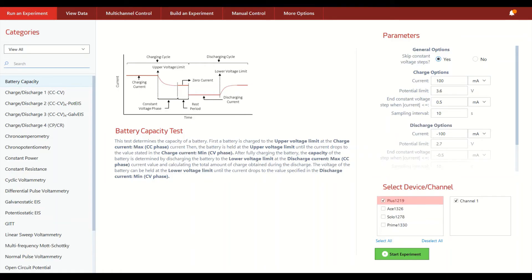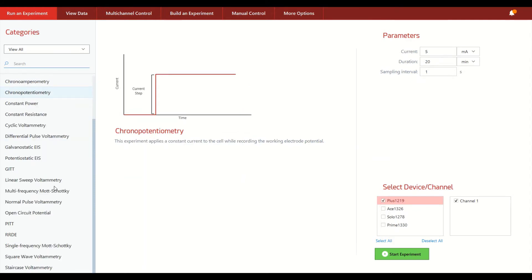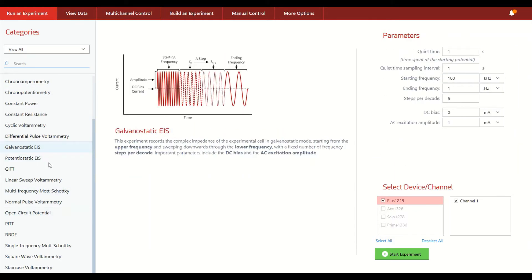So here it is, our Squidstat user interface. And so to begin with, we have our run an experiment screen. So this is the main window that appears when you open our software. And you can see on the left side of the screen all of the most commonly used electrochemistry experiments that one would expect any research grade Potentiostat to be able to carry out.